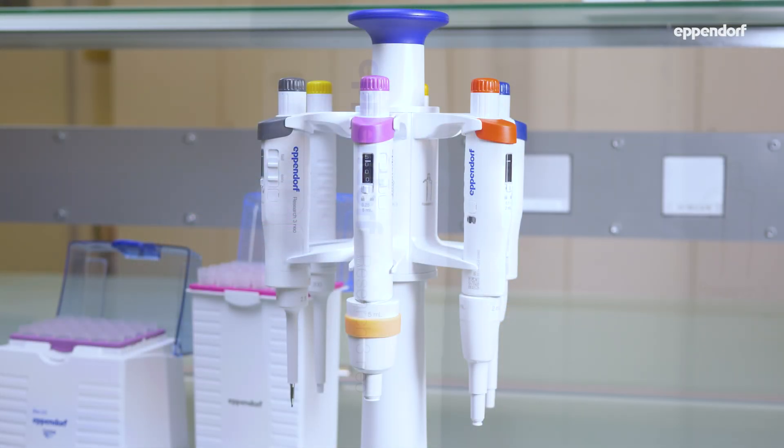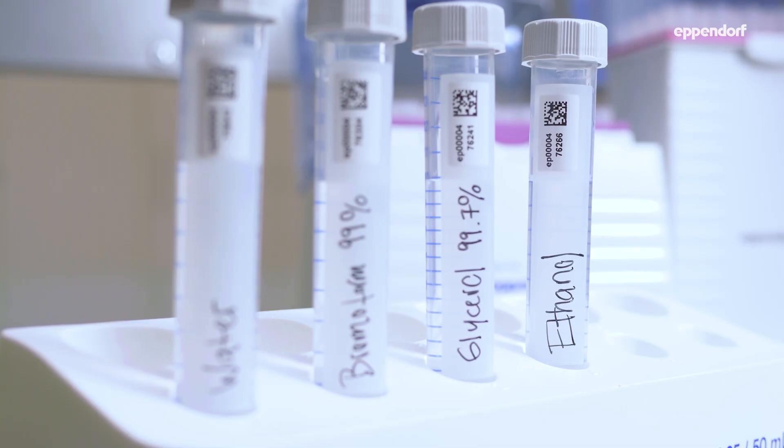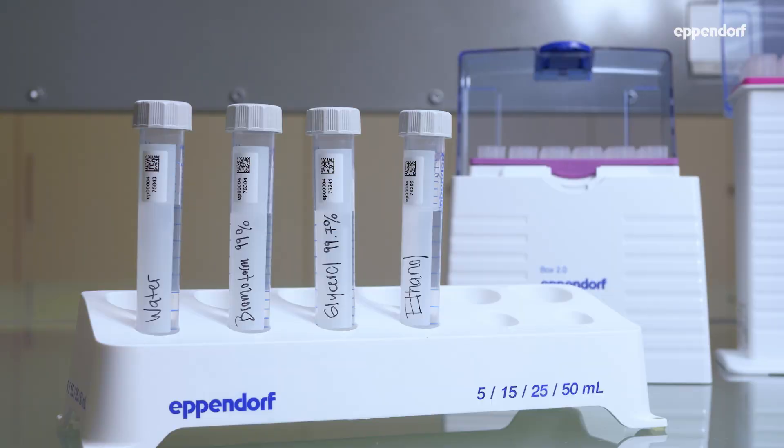Air cushion pipettes such as the Eppendorf Research 3 work best for pipetting aqueous liquids. Solutions that are dense, viscous, or volatile might require an adjustment for increased accuracy.